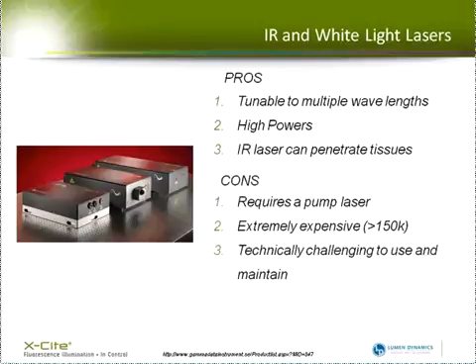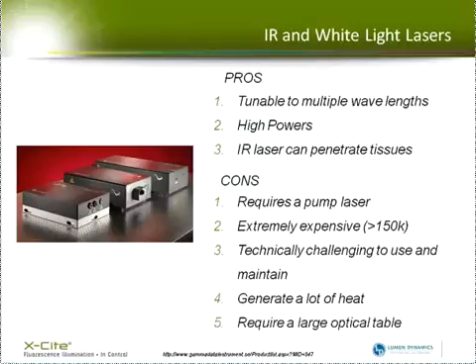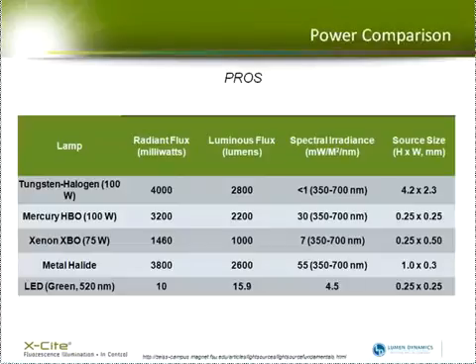They're technically challenging to use and maintain, so you normally need somebody who's going to be around on a regular basis and keep them tuned and aligned. And they generate a lot of heat, so you may have to do modifications to your workspace, your microscope room, in order to deal with the heat. And they typically require large optical tables because they're coupled into the microscope directly. They're not coupled by fibers.